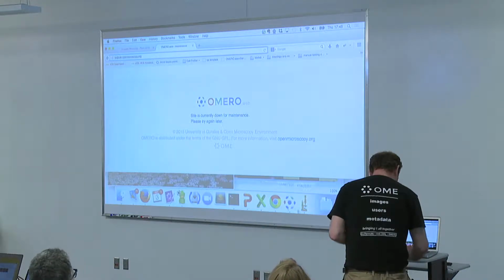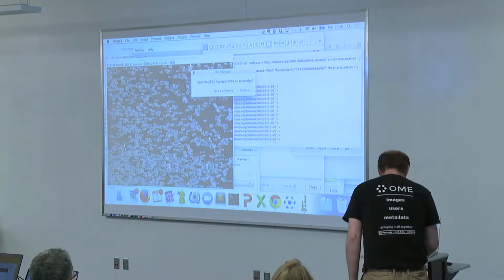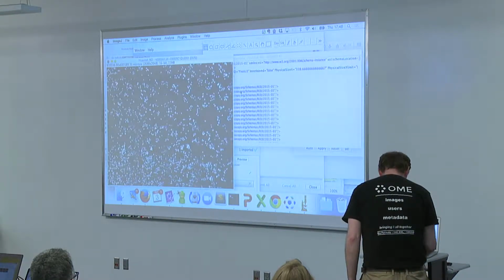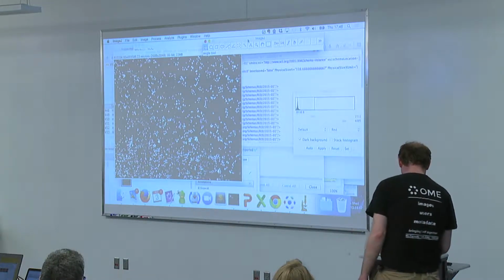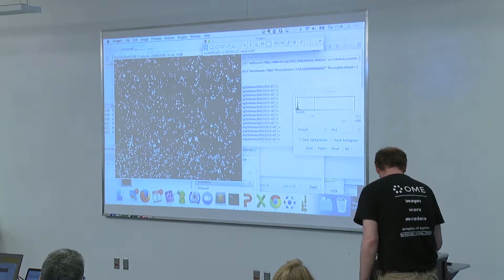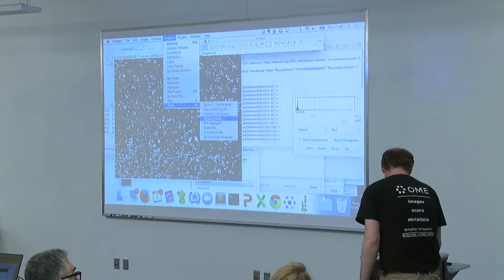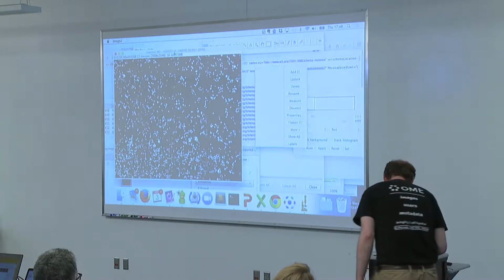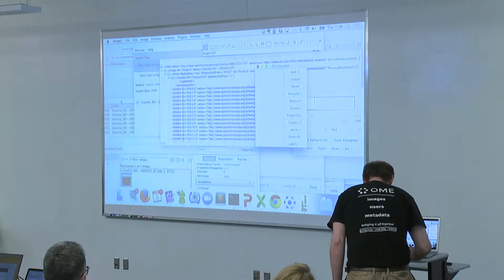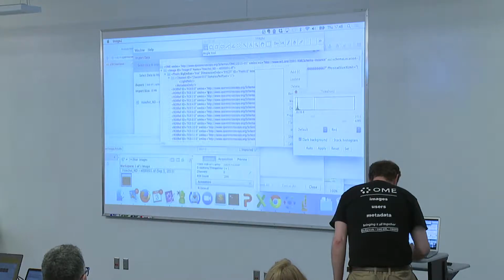Right. So I was showing you the round trip. Good. So this is an image which OMERO knows already. I have to take care about what is in my ROI manager. So I don't know if you are going with me, but oh, the ROI manager is empty. Let me just be sure what I'm doing here, because this is just a mess. So I will clean it up.